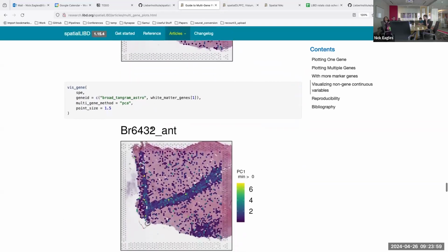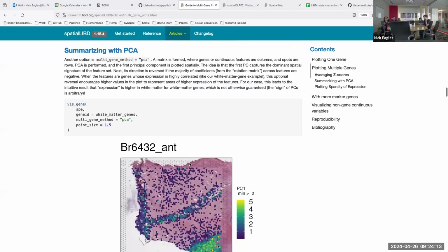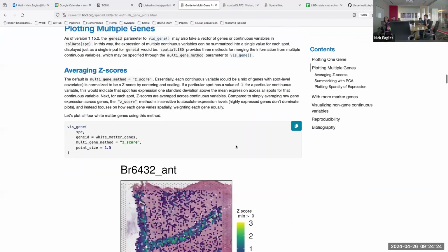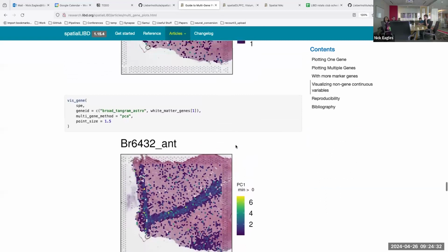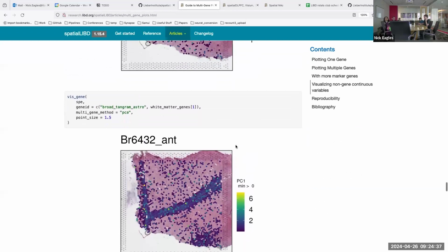But interestingly enough, if we combine that with GFAP, then you get a very clean plot, which is a little bit surprising. If you just remember this plot, I'm going to go back up to the GFAP one. It's pretty high up here, so it looks like this, right? The idea here is that astrocytes are going to be co-located with GFAP and should have a similar signal.